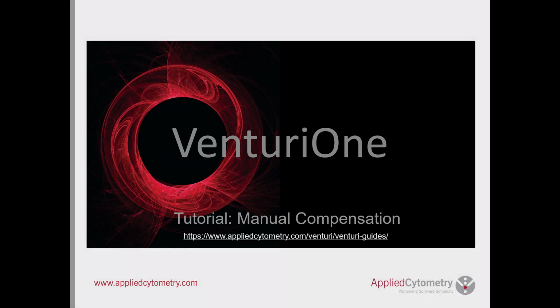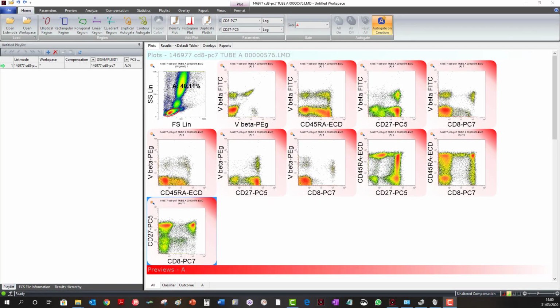Manual compensation. By default, VenturiOne will read the compensation that is saved with the file. It does allow you to change the settings or to calculate the compensation settings and then apply them to a series of files. Firstly, we will look at how we can change the compensation settings on a single file.